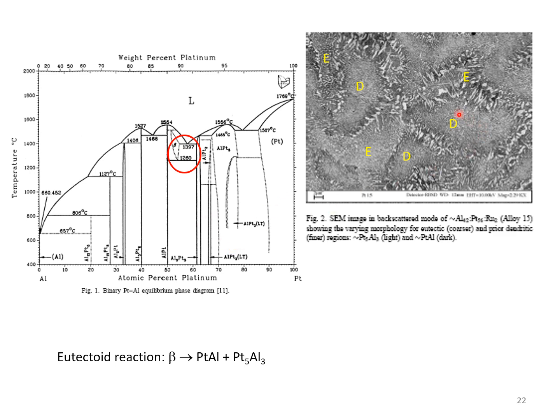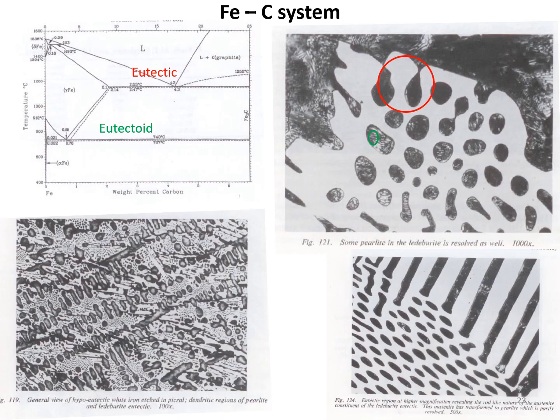But what we've got here is, you can see this alloy composition was in here somewhere. So you had, this is now decomposed. This was beta and it's now decomposed. So that might catch you out.